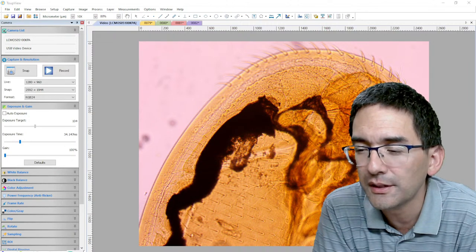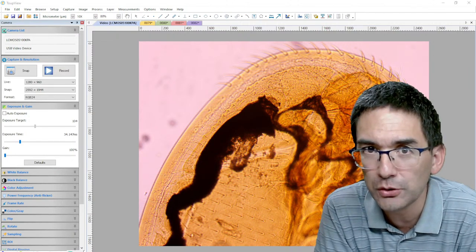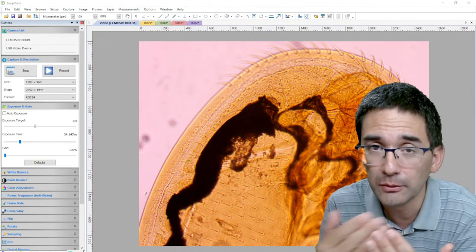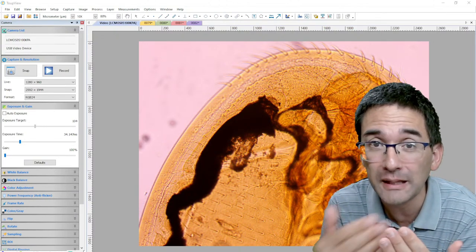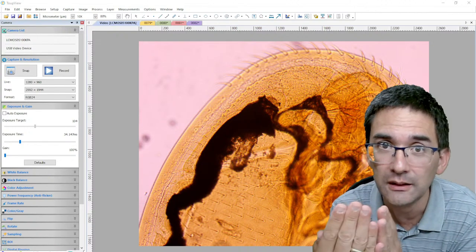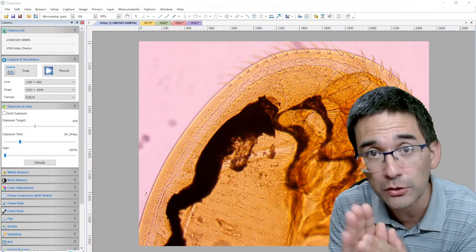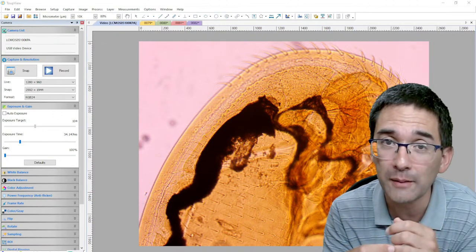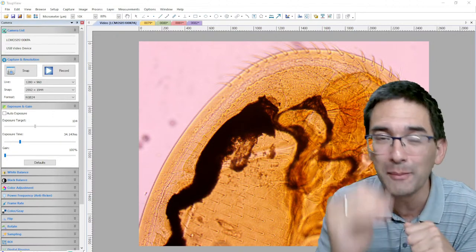There are several stitching programs, as I mentioned, but you have to choose one where you're able to stitch images together on a flat plane, not with a rotating camera, because some stitching programs assume that you have a rotating camera because you want to make a panorama. And some stitching programs, especially the cheaper ones, do not allow two-dimensional stitching.